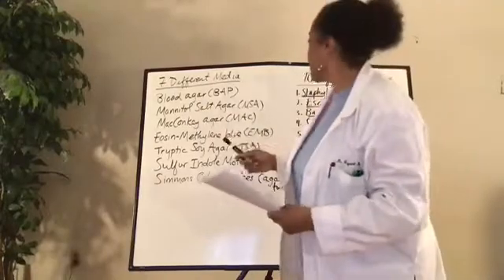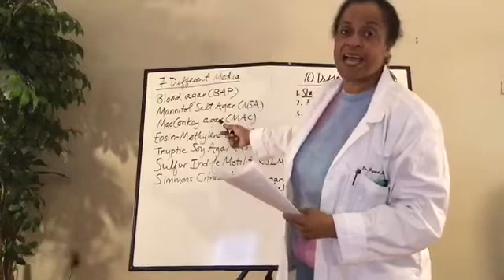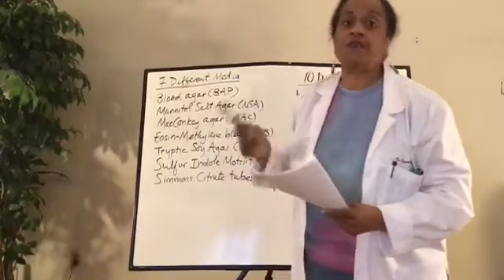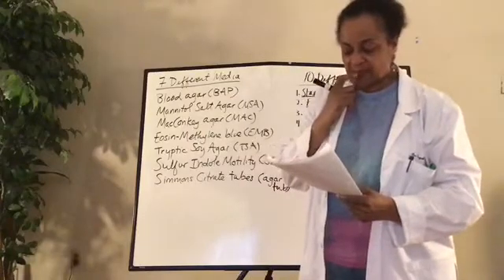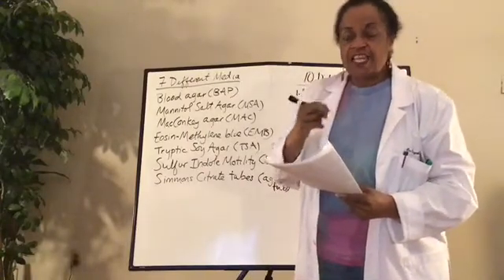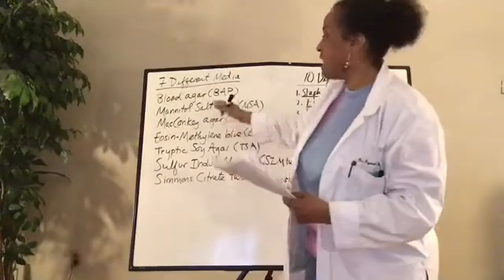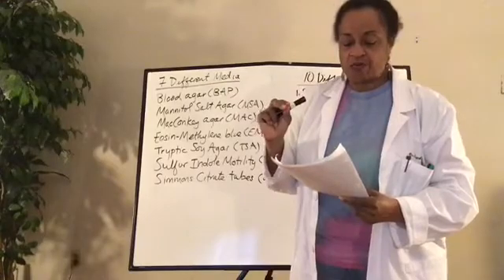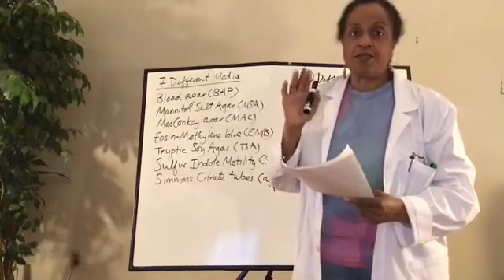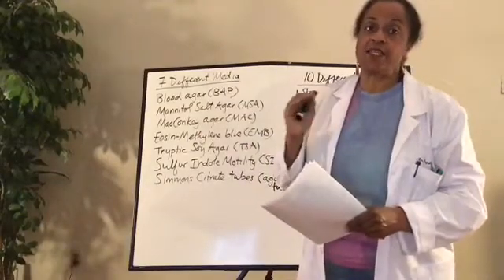Plus the fact Staph aureus really likes a high salt content and can grow on it, as well as fermenting this sugar called mannitol. It changes the pH indicator that is in this agar from red to yellow around the colonies. So what changes? The agar changes colors from red to yellow.